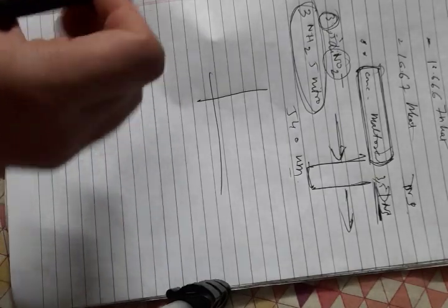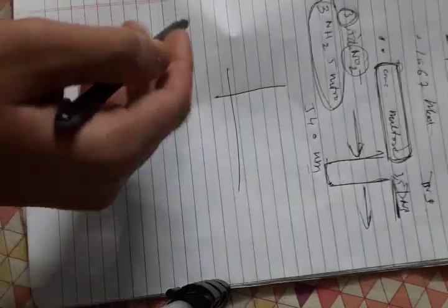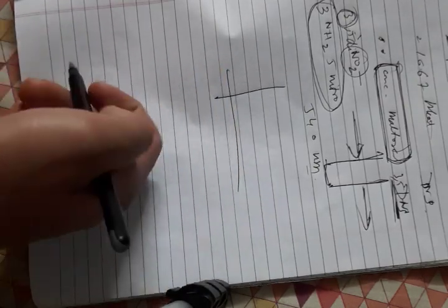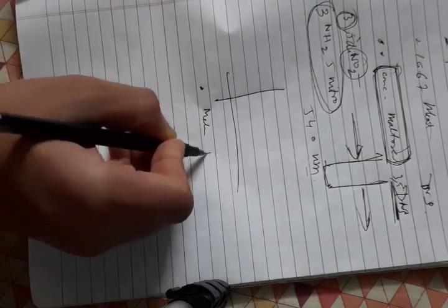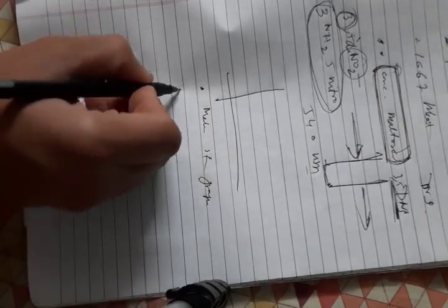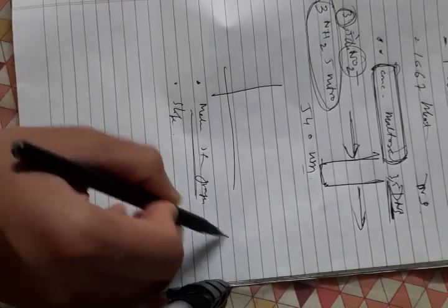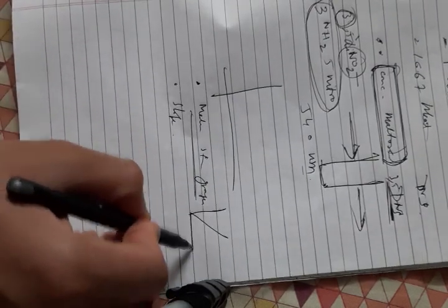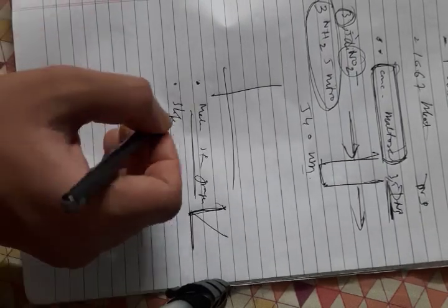Okay, I'm just telling the procedure of the analysis part briefly. At first we need to make the standard graph or curve, and then find the slope of it, because we know that in the Lambert-Beer law it will be a straight line, the OD versus concentration graph.